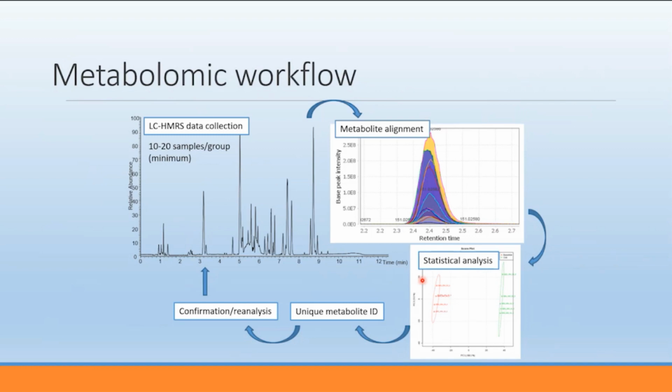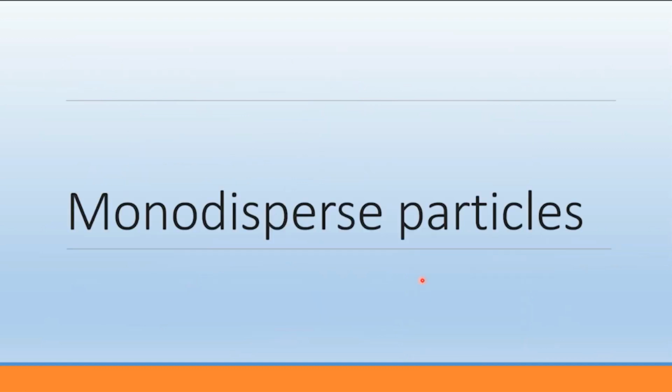So it's a combination of chromatography and mass that makes a very big difference in how we do metabolomics and how we conduct an identification process in metabolomics. And so that gets me into part of what I'd like to talk to you about today in terms of science: the evaluation of monodisperse particles and their potential in improving how we do metabolomics across a large subset of samples, or improving how we separate metabolites using this new approach in this new form of particle column.